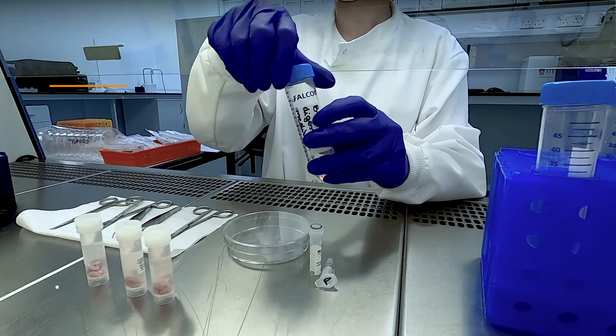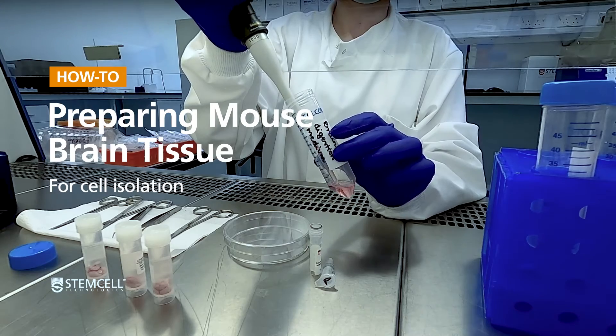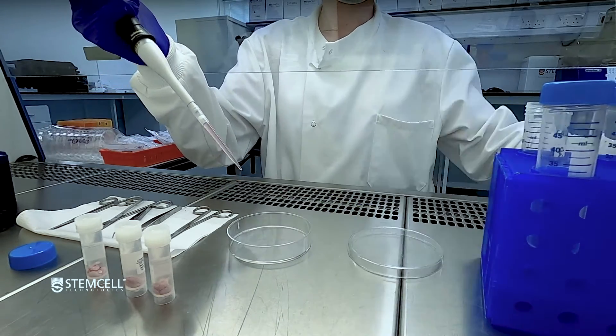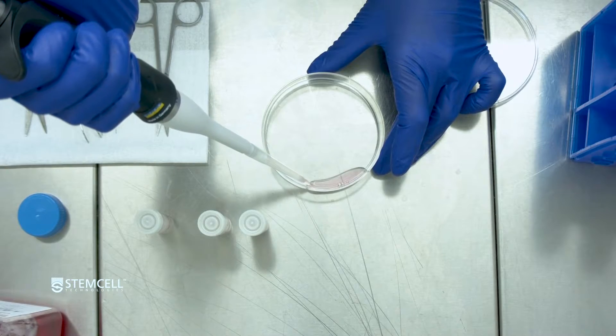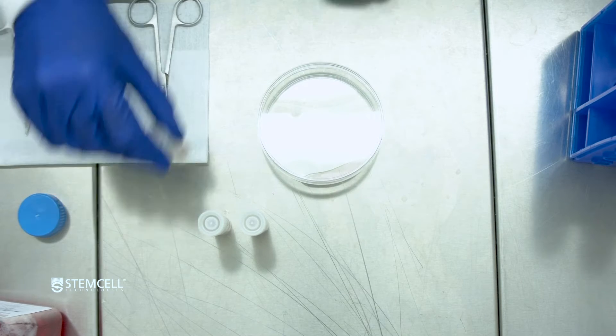This video outlines a method to prepare a single cell suspension from harvested mouse brain tissue to be used in subsequent cell separation. This method has been optimized for downstream isolation of microglia using the EasySep Mouse CD11B Positive Selection Kit 2.